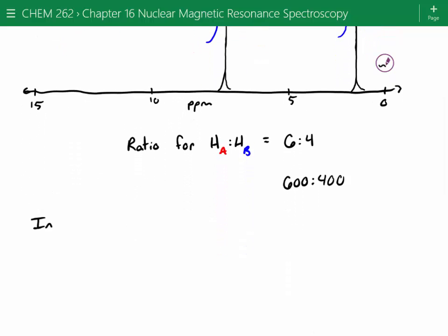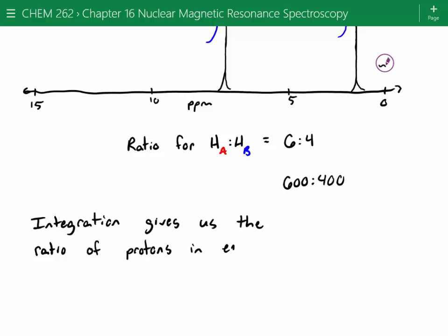So integration gives the ratio of protons in each unique set.